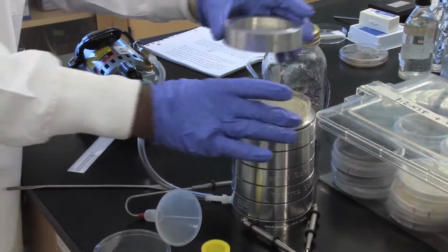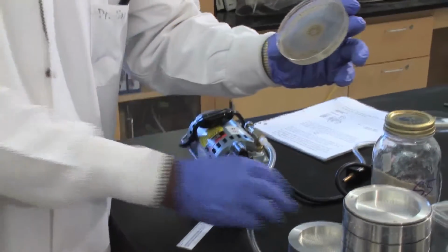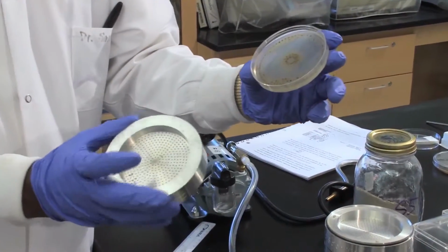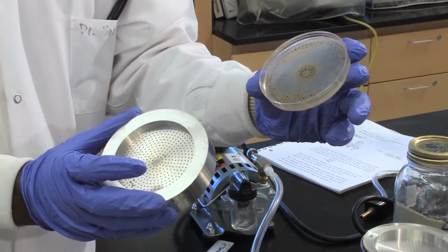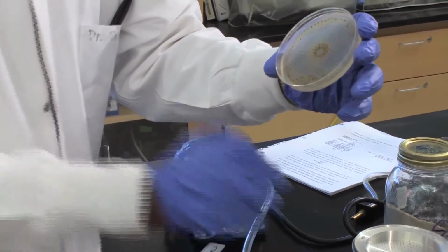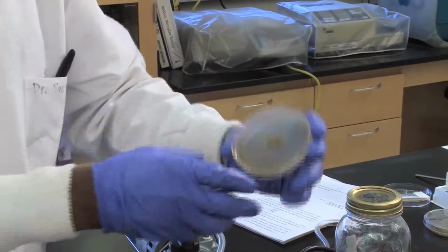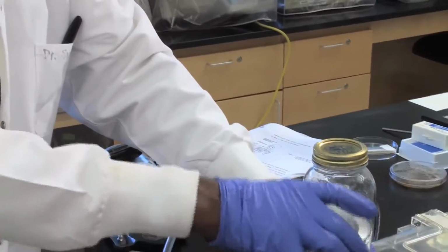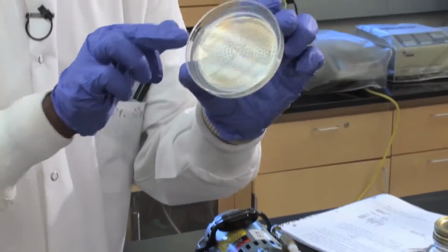Again, you can see here that if you remember, we have this round perforation. So you can see underneath each one of them, there's been impact from it. And if we go to the next one below, I don't know how much you can see, but can you see it?